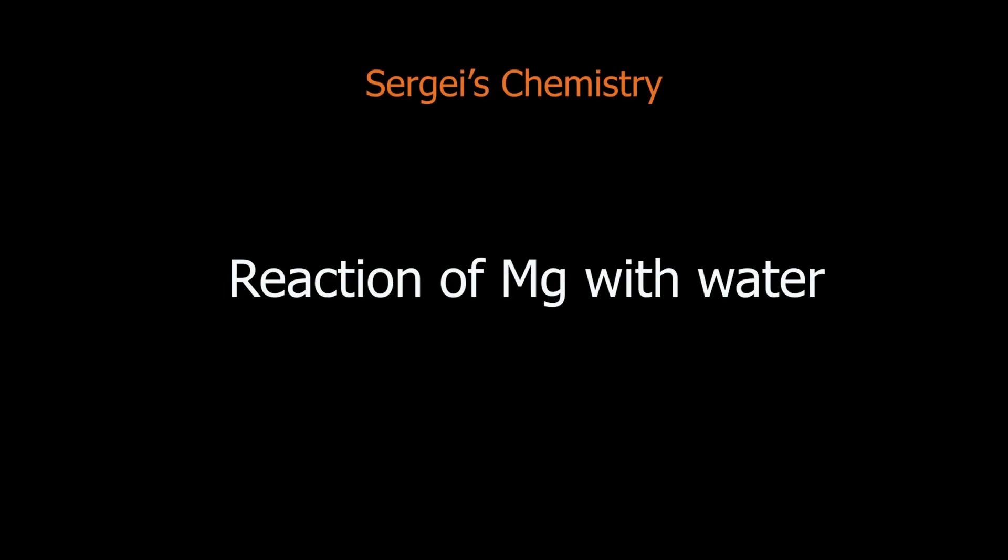Welcome to Sergei's chemistry. Today we are looking at reaction of magnesium metal with water, with cold water and with hot water vapor.